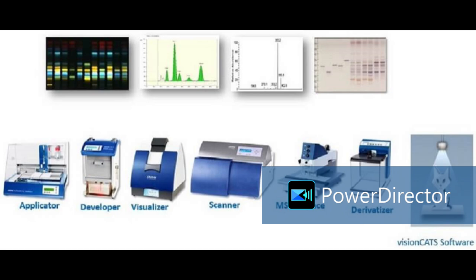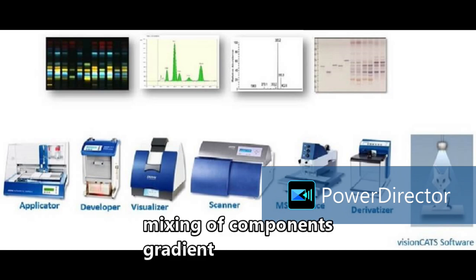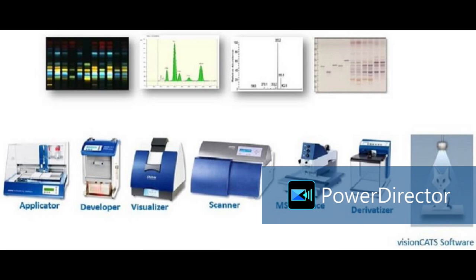AMD2, gradient type of HPTLC. You know isocratic and gradient systems. Isocratic means by using single composition of the mobile phase, and gradient means different compositions of the mobile phase during development. Okay, like in HPLC, up to 5 minutes run with methanol, then 5 to 10 minutes methanol plus water, then 10 to 15 minutes methanol water buffer. So mixing of different components, so compositional change of mobile phase, that is possible in HPTLC also.